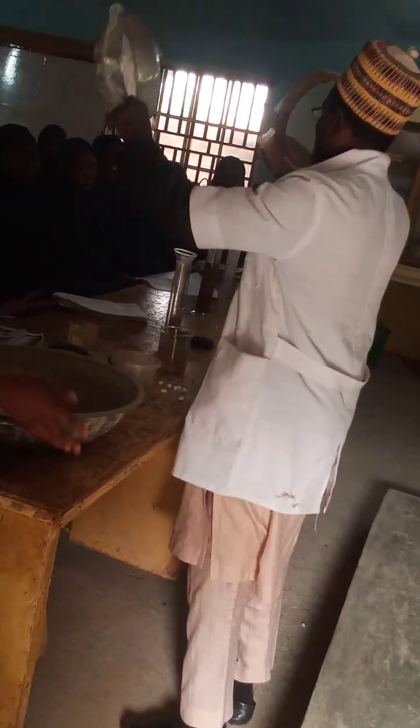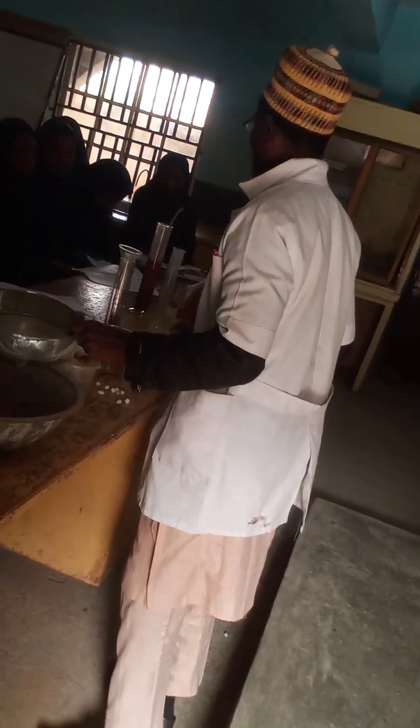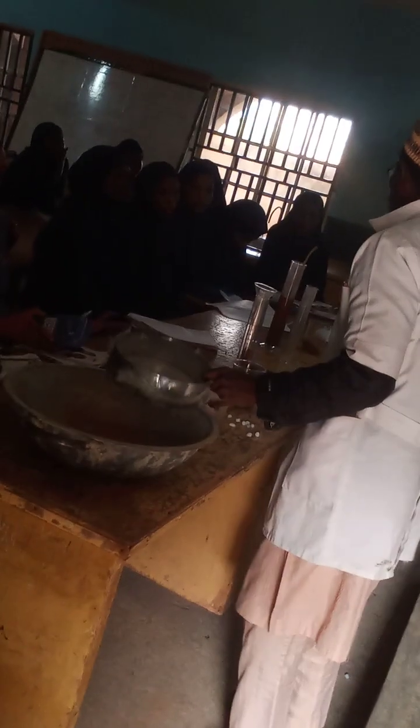This one is the smallest, followed by this one, while this one has the largest diameter. So these are the sieves that are going to be used in the sieving method, just like the way you sieve your flour at home.